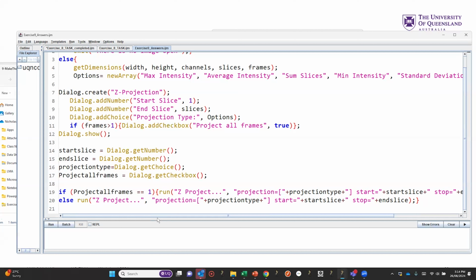So it's kind of introducing a few concepts or confirming a few concepts: getting a variable, applying, creating arrays. This is new, but very useful, having these options to toggle on and off things for your scripts. How to get scripts and then how to do something.